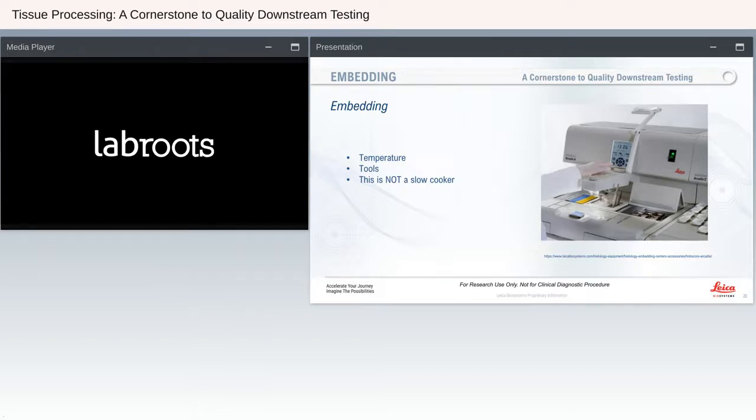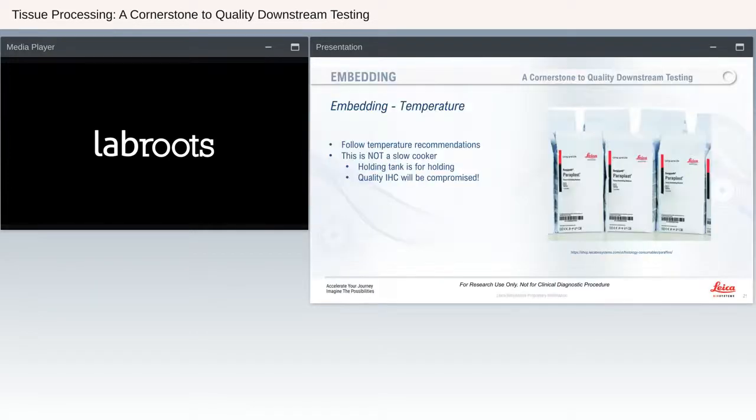One thing to be mindful of, and I mentioned this previously, is that I see more life science people in the laboratory taking temperature into account, especially with molecular testing. Low temp paraffin is usually the option of choice. There are tools that we're going to talk about. And one little note I made at the bottom, and I'll explain this a little bit later, is that this is not a slow cooker for your tissue. So let's talk about embedding medium.